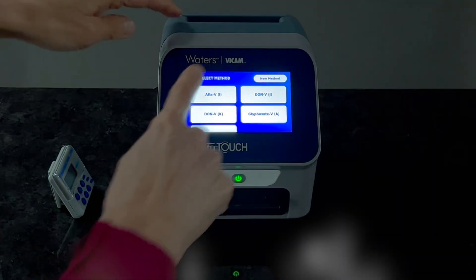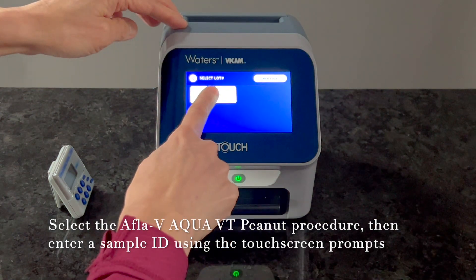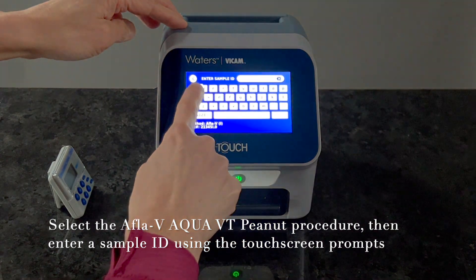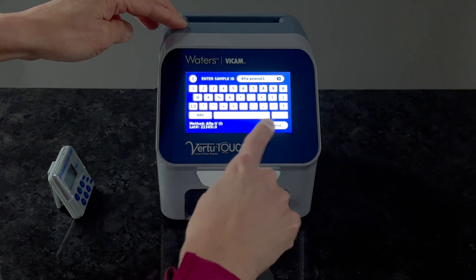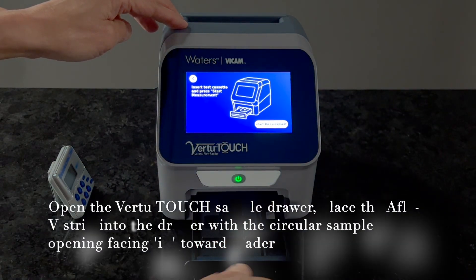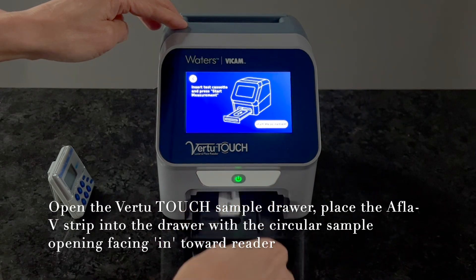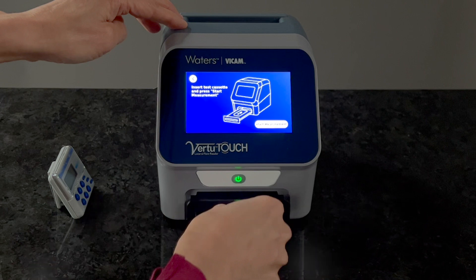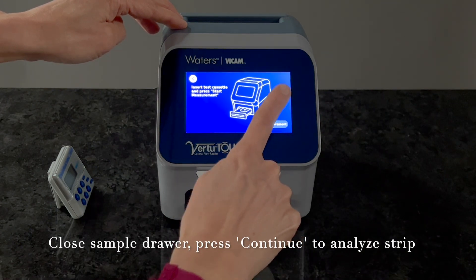While the strip is developing, select the Afla-V AQUA VT peanut method from the VertuTOUCH Reader menu, entering a sample ID when prompted. Open the VertuTOUCH Reader sample drawer, placing the Afla-V strip into the drawer with the circular sample opening facing toward the reader. Then close the drawer and press continue to analyze the test strip.